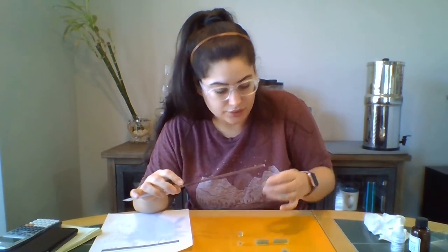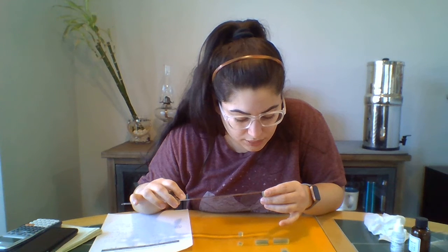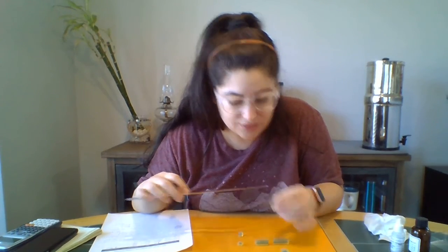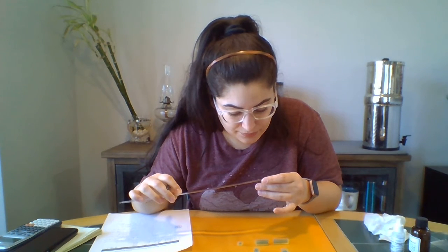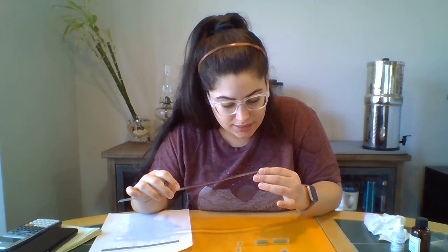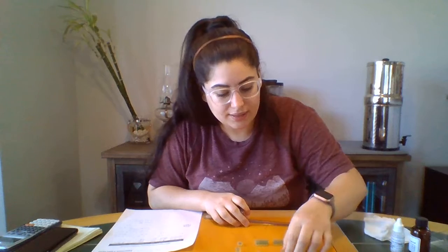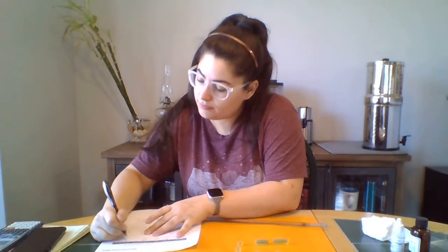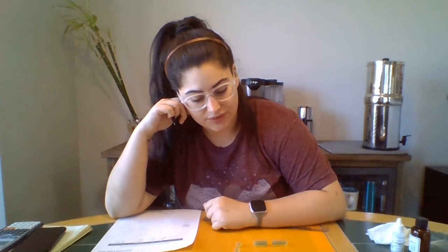Whoop. So slippery. One, two. Well, it's like 0.25. It's really similar. I mean, it's slightly more. I'm gonna say 0.3. It is. Yeah. So I do wonder if it was supposed to be the same distance of diffusion.